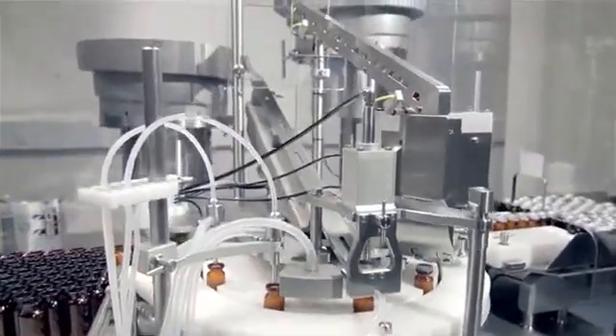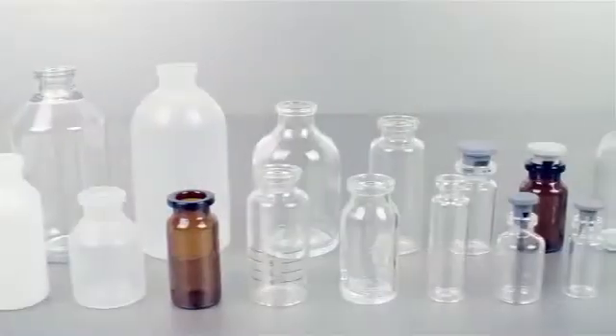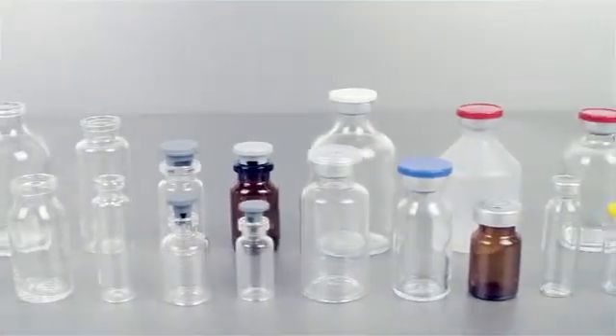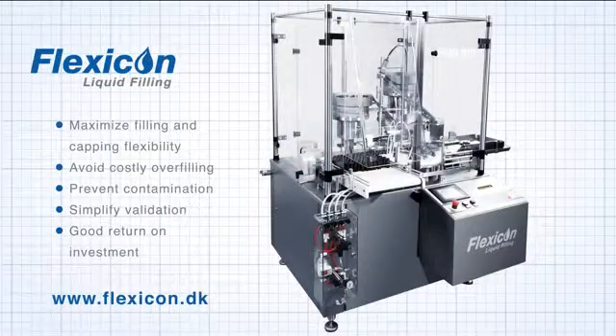Our automatic filling and capping systems have been installed in more than 37 countries, serving the diagnostic, biotech and pharmaceutical industries. The systems are extremely reliable, deliver improved flexibility, reduced production costs, minimum risk of leaking containers, less costly overfilling, and a more efficient validation process.